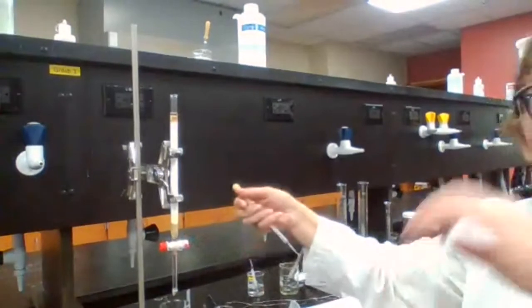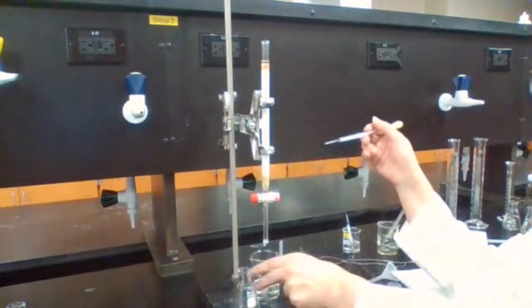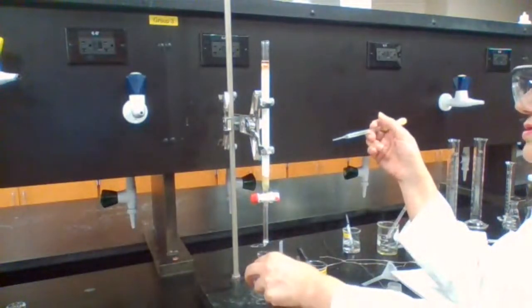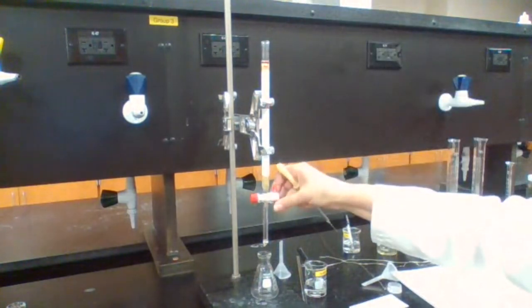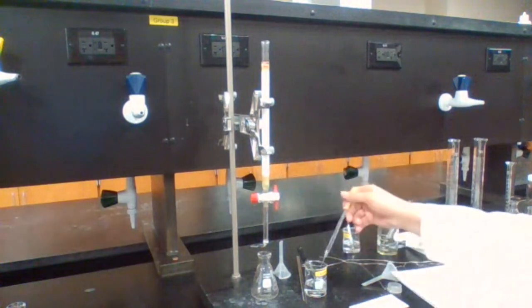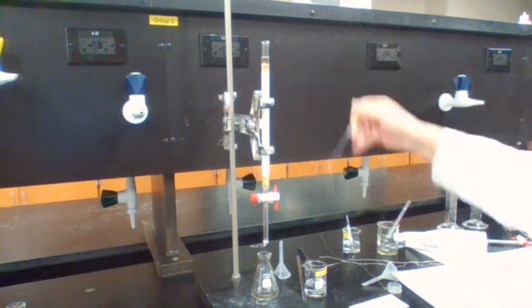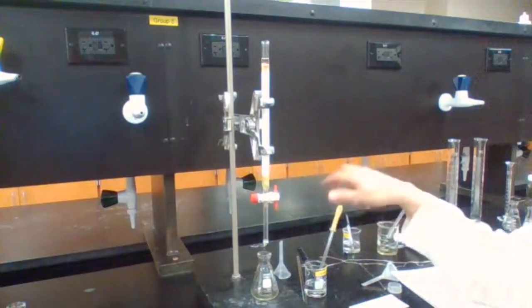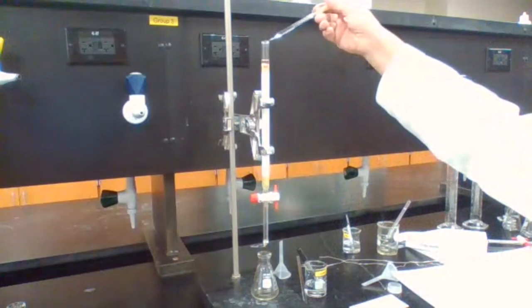Now I'm changing. You see the yellow color all the way down here. Now I'm switching the beaker into fraction 2, and I keep adding the same polar solvent. And how much of that solution should I collect? For how long should I continue collection or adding the acetone at this point? Could you tell me, please?